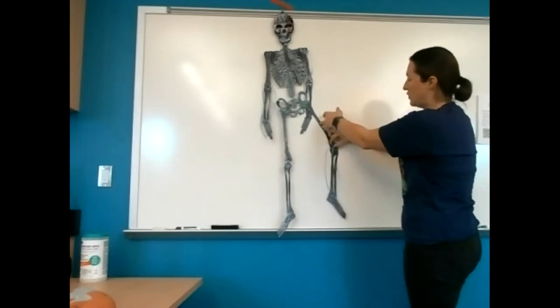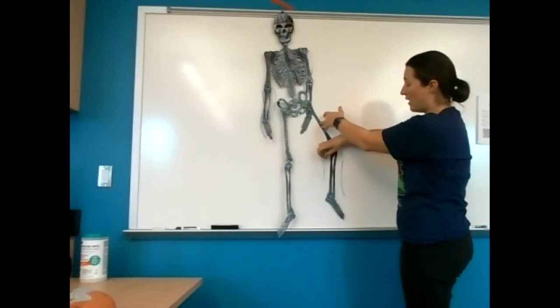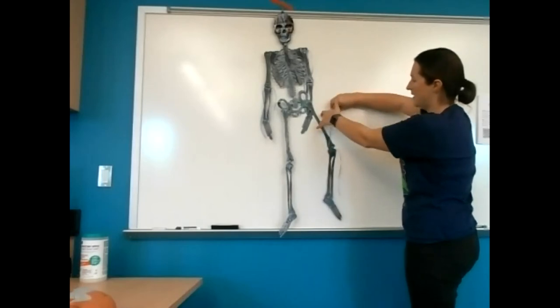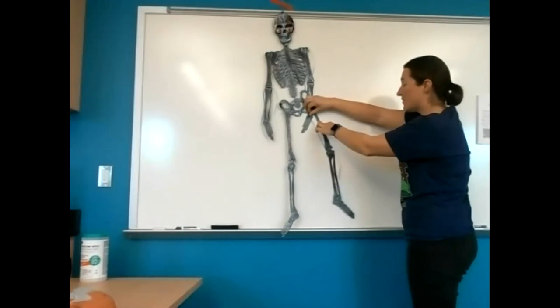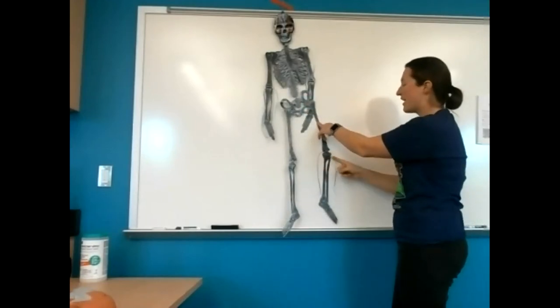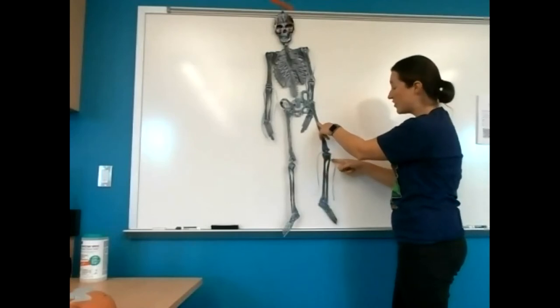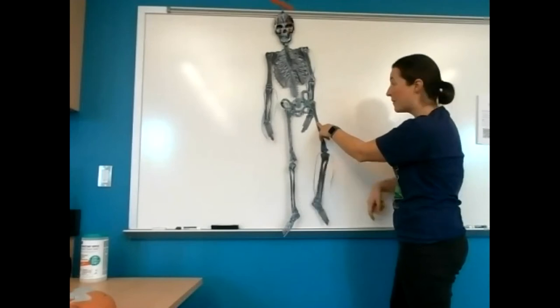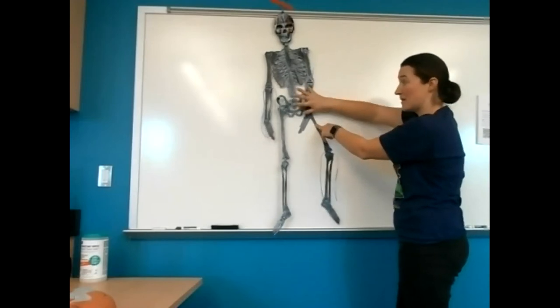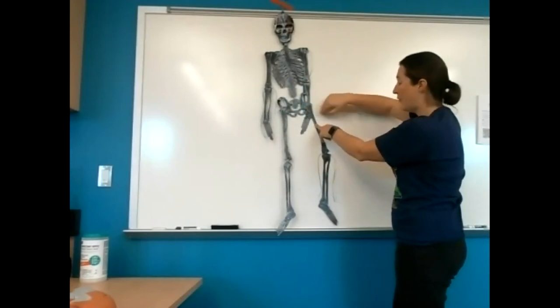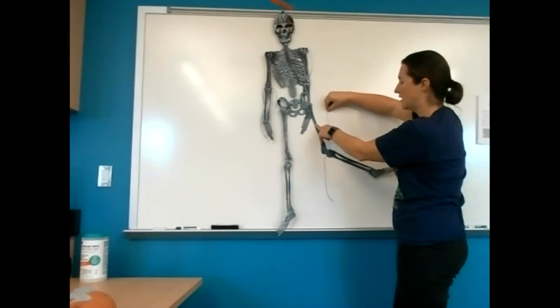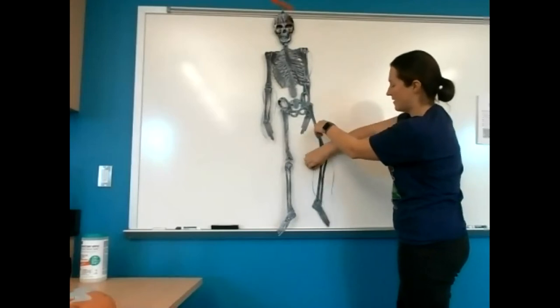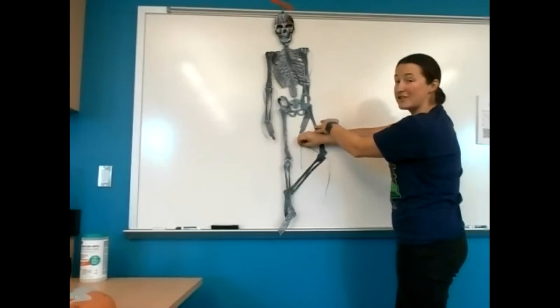Now, if we pull on the other insertion — pulling insertion towards origin — we see exactly the opposite movement. These are antagonistic actions. The insertions are on opposite sides of the joint. The movable point is farther away from the body. When the sarcomere shortens, the insertion is pulled towards the origin, producing either extension or flexion at the knee.